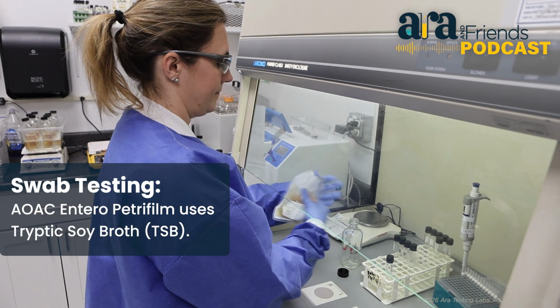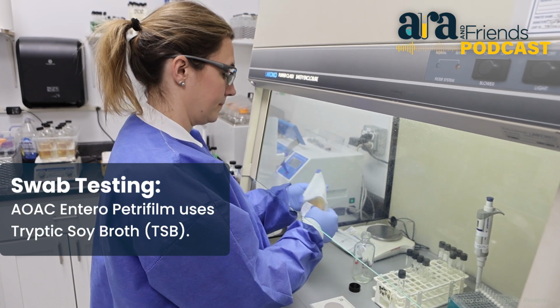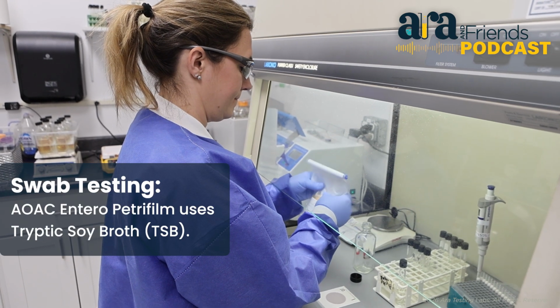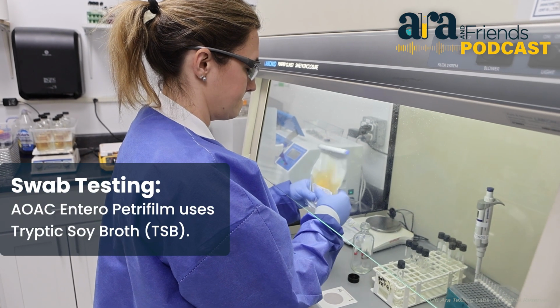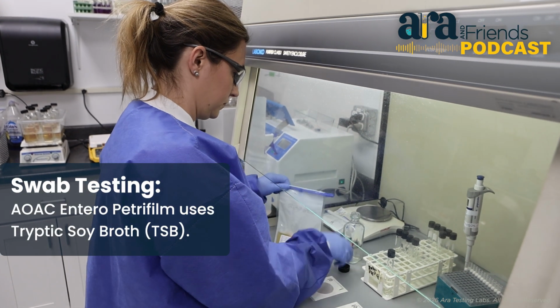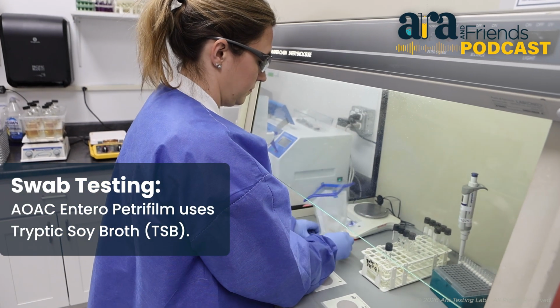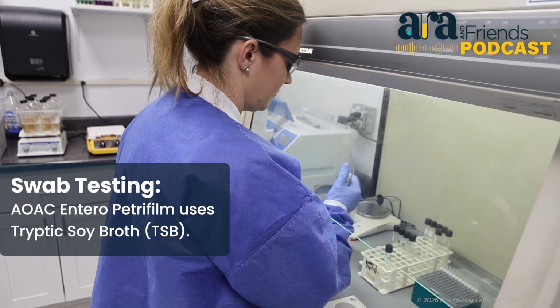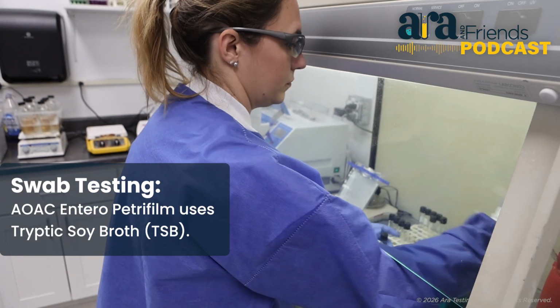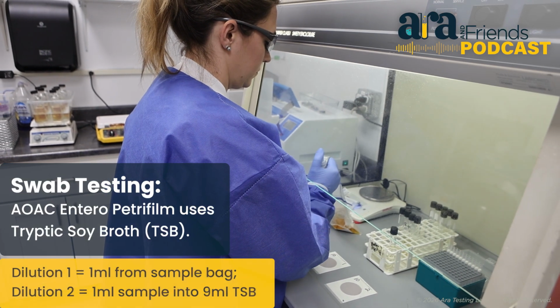Mix it up. And this is a sponge, like, you know, probably an equipment sponge or something for that plant's environmental testing. Right. And on this one, do you do dilutions 1 and 2?